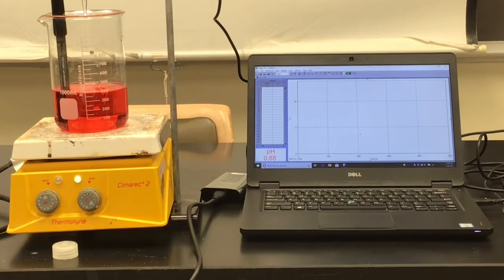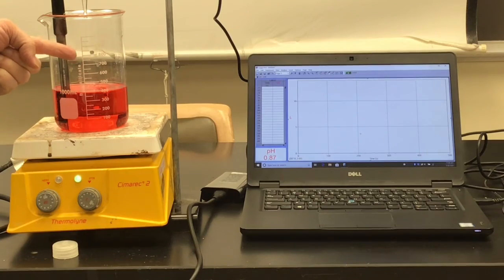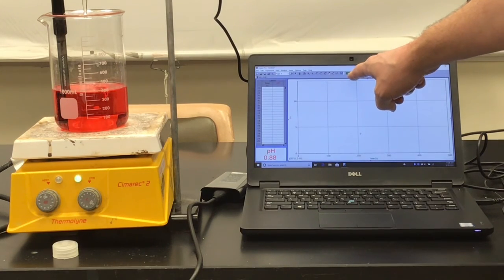Okay, so what's going to happen now is I'm going to go over here and start my flow of base. Again, I'm going to be taking a strong base and putting it in there at a constant rate. While I do that, I'm going to click the collect button here on my device.